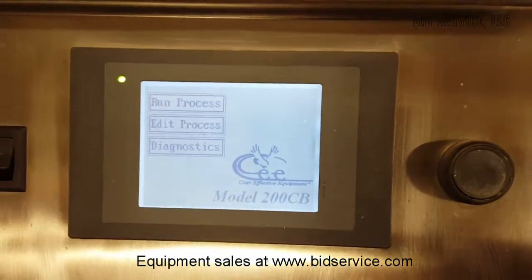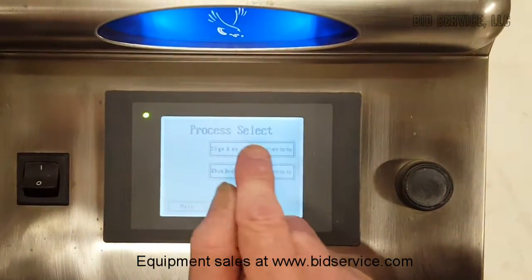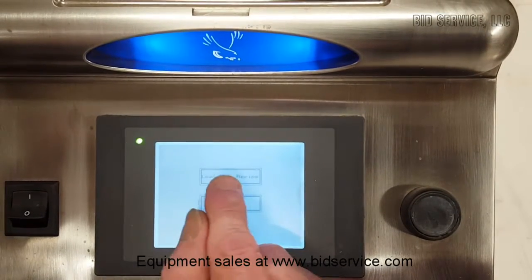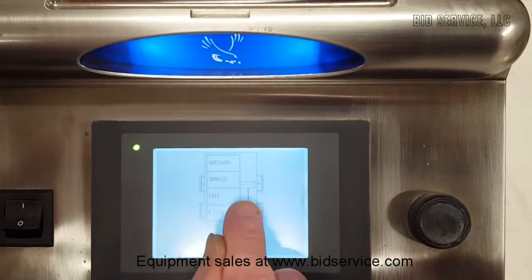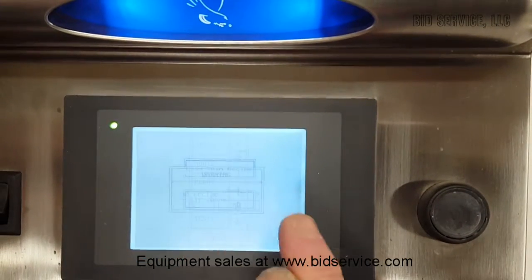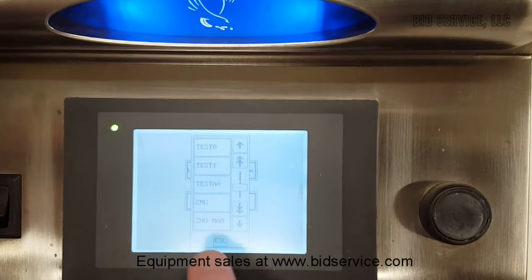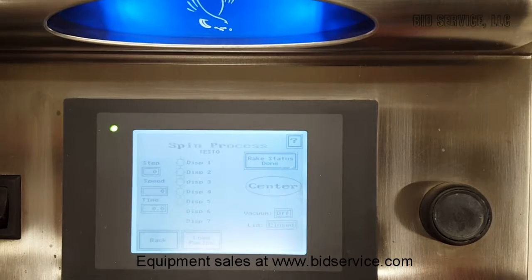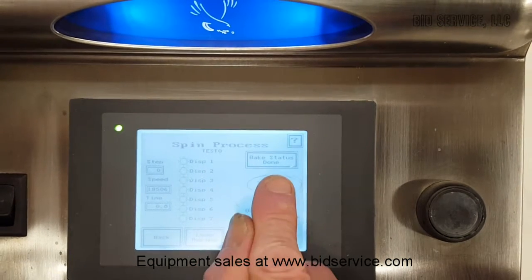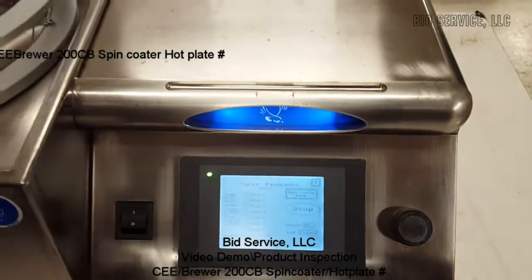And that's all there is really to running the system. We'll leave you with a running program. I'll go back to the first one I had on there. Test zero is up, we are centered, and we'll spin. And that completes this demonstration.